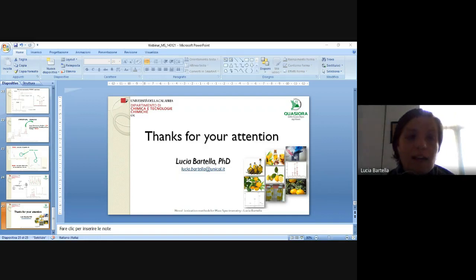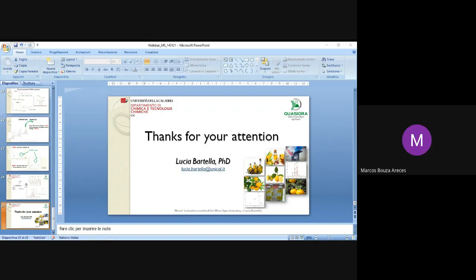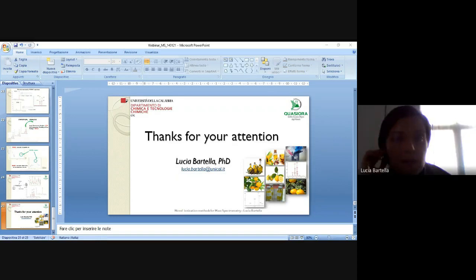Sorry, but can we go to the previous slide? The one that you have now, for example, you have the TIC for the paper spray analysis, and it looks like you have peaks while you're measuring. Sorry, but I don't understand.